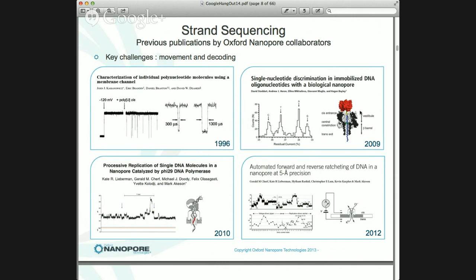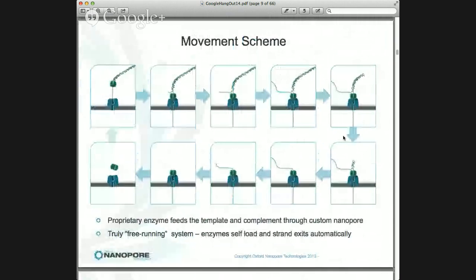Now Hagen and some others showed that if you take a piece of DNA and dangle it in a pore, and he just used a big blob of protein, and again that will just get trapped and sit there as a static complex. But he showed that by modifying the inside of the pore at the narrowest point closest to the DNA, he could change the block of that DNA in a way that appeared to be characteristic of certain bases. Now again, we reproduced all of that, and we reproduced it in both a static and a moving system, and we found that pretty much every protein pore actually measures more than one base. It measures 3, 4, 5, even 11 bases at once. And that when you change that protein, you actually can change the signal given by a collection of bases. So our challenge then was to make it better and to figure out how to decode those signals in a reproducible fashion, which of course we did. And that was our proof of concept.